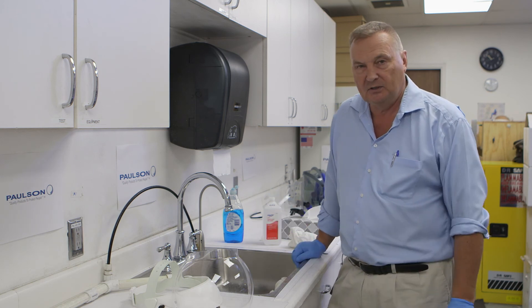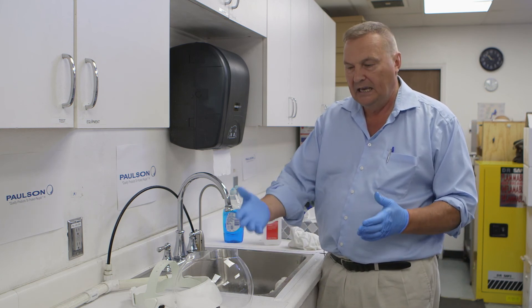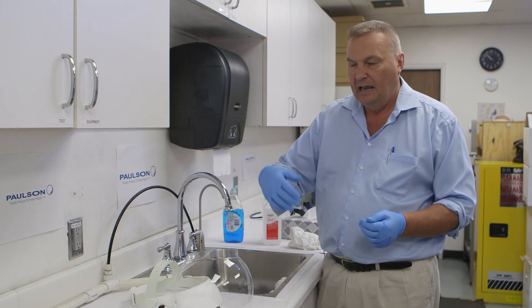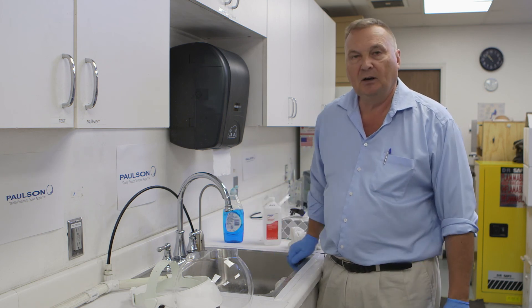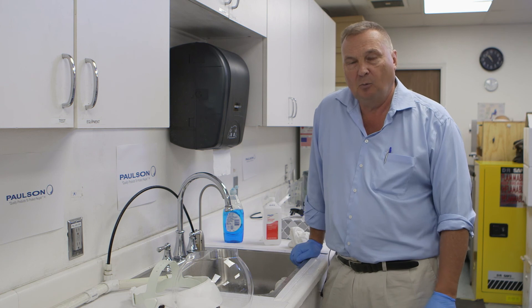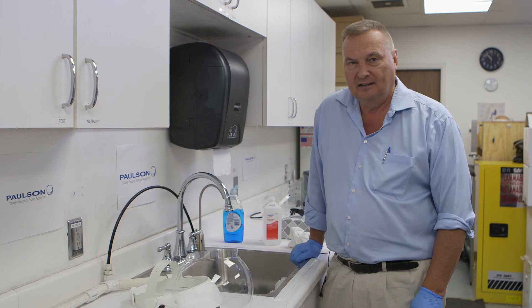With this type of work, we're able to keep our products clean, and it will actually extend the life of the product. We would expect to see 100 times that you could wash and sanitize the item and put it back in service. Thank you.